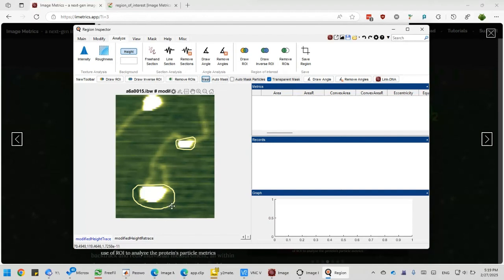So, in this case, I would like to get rid of that bleeding, right? So, how to do that? Okay, I can either make a better region of interest. Right? I can redraw that because right now I'm not doing it in a precise manner.